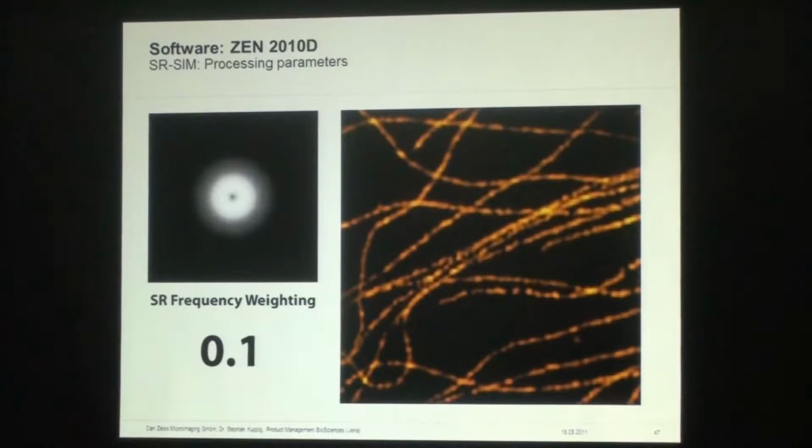And then the frequency weighting, it's also from 0 to 2. As you can see, it's a kind of sharpening filter. You can see whether you want an isotropic distribution of the frequency or to emphasize the increased frequencies. If you use too much emphasis, you will see more sharpening, or too much fuzziness if you go either way. So normally 1 is the default.